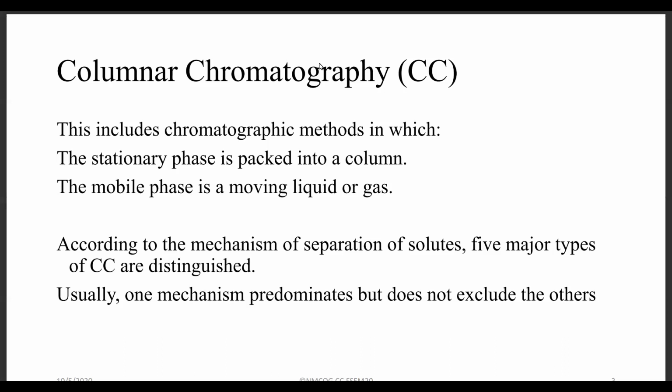So the whole basis of this is, let me see if I can get it. Columns. So we have a column there somewhere. And then assume that the column is packed with what we call our stationary phase.